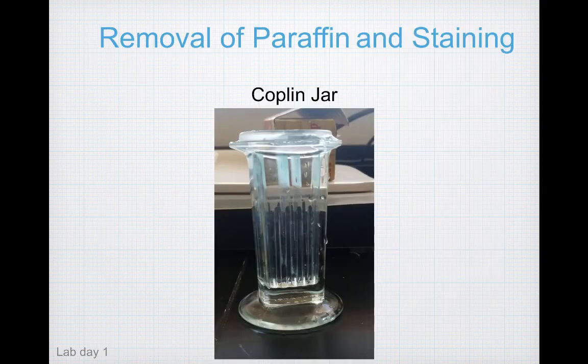Before talking about the next steps — removal of paraffin and staining — I want to introduce you to a Coplin jar. A Coplin jar has grooves in it so that microscope slides can stand on their end, allowing you to process many slides at one time. Each Coplin jar accommodates five slides and holds about 40 milliliters of liquid, so you'll need about three Coplin jars.